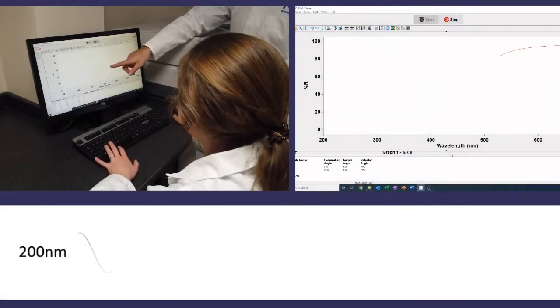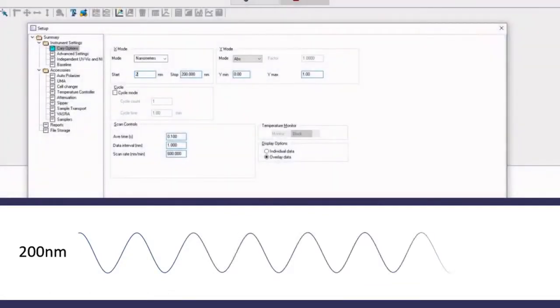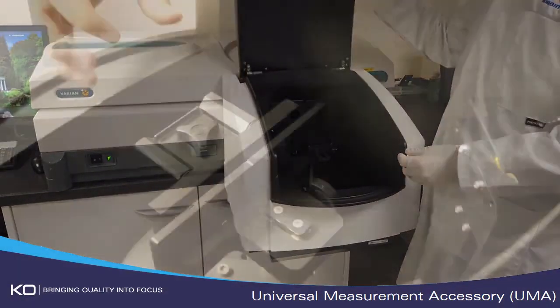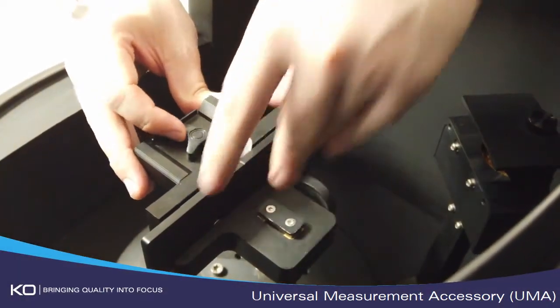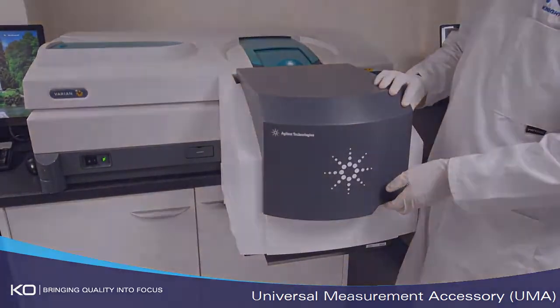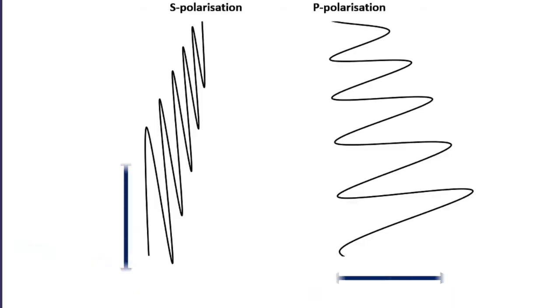With this instrument we can measure spectral performance from the ultraviolet all the way into the near-infrared. With the universal measurement accessory, or UMA for short, we have the advantage of not only being able to measure transmission and reflection at almost any angle of incidence, but also measure the performance at different polarisation orientations.